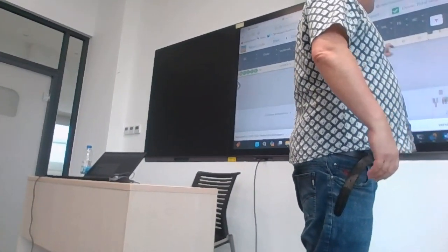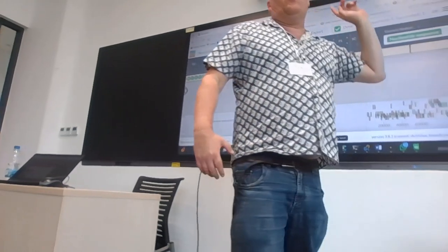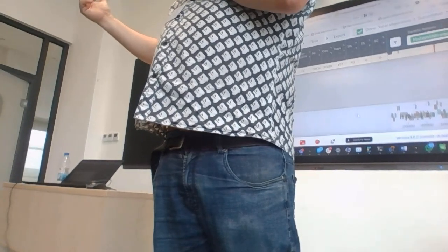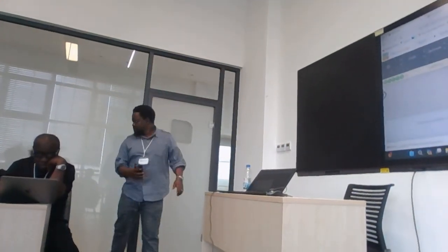And then we have two positions which are non-ACTGN. And then over here we have, compared to this B1 clade genome, the sample that I've got was actually collected, I think, last year or the year before. We only have one mutation compared to the reference. This is almost identical to the reference, okay? So we've sequenced almost the entire genome, and for our efforts, we've got one mutation, okay?